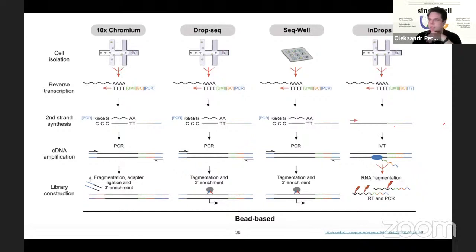That's perfect. Another question we have, I think we still have some time for one or two questions: what is the connection between UMI-based libraries and batch effect? Do you think there's any connection, any opinion on that?